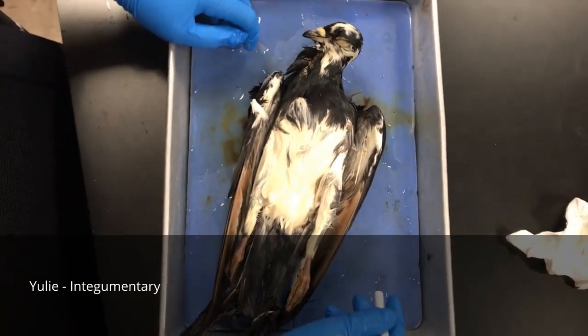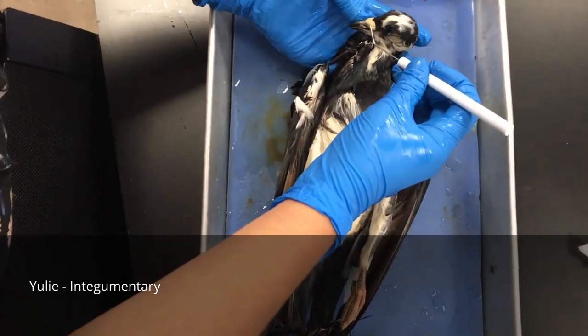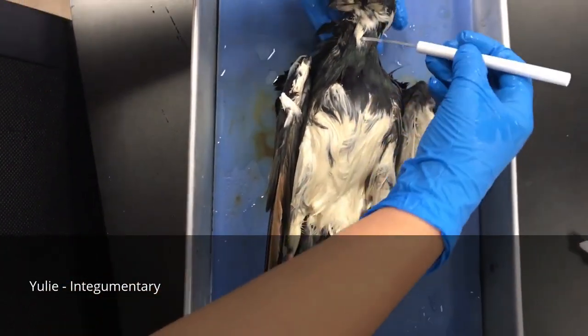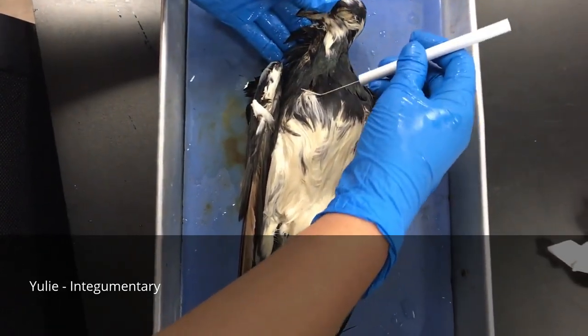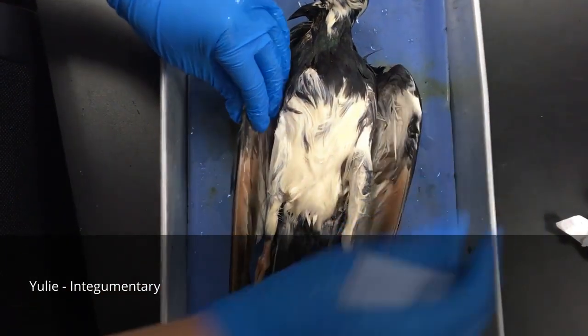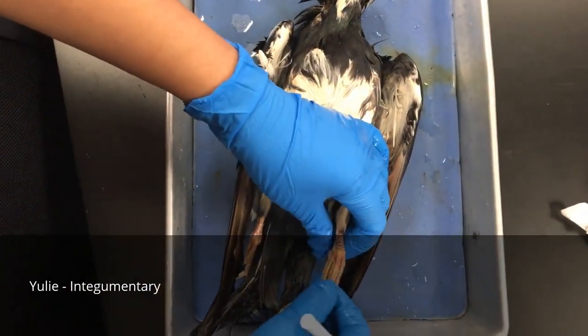We're going to be studying the integumentary system first. This is his forehead. Right here are his lobes. This is his beak. Up here is the crown of his head. This is his neck and crop region. Down here, all of this are his feathers. And then you're going to see down here, these are his feet.